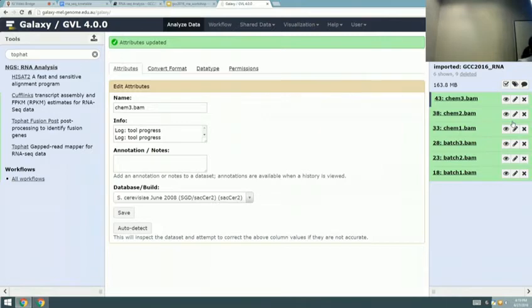This organism doesn't really have a lot of splice junctions in chromosome 1, but in humans, you'll be able to see more complex splice patterns. The workshop actually suggests using Trackster, but I'm going to skip that for today. So if you want to, you can do it on your own time, I guess.